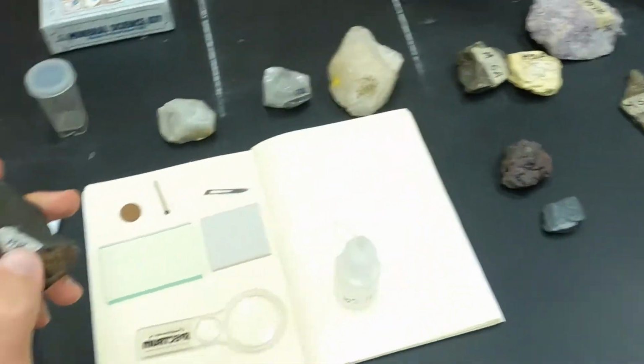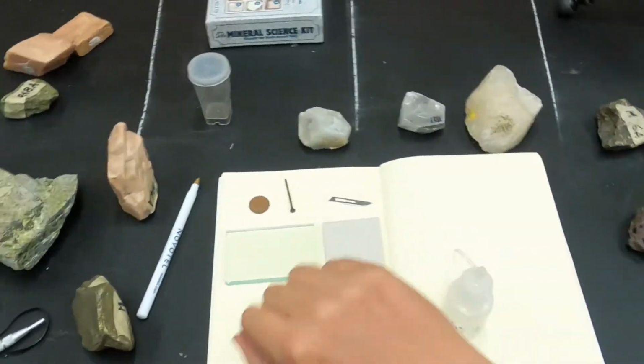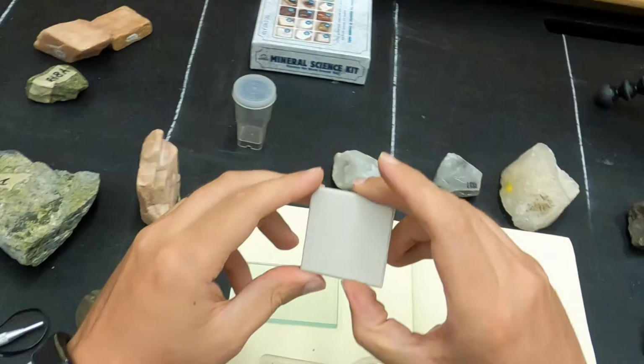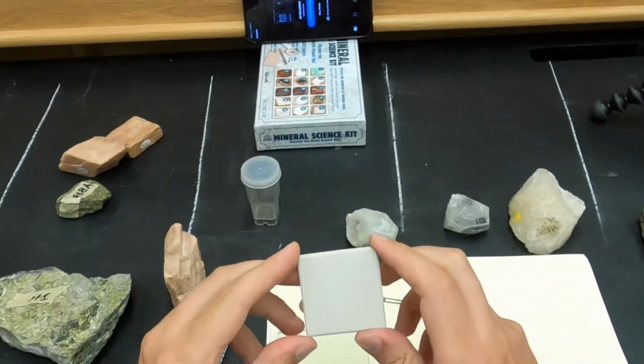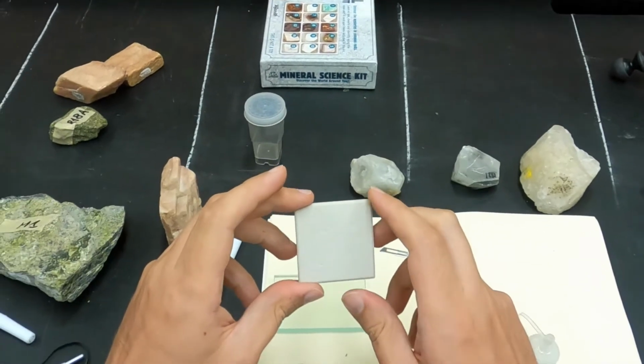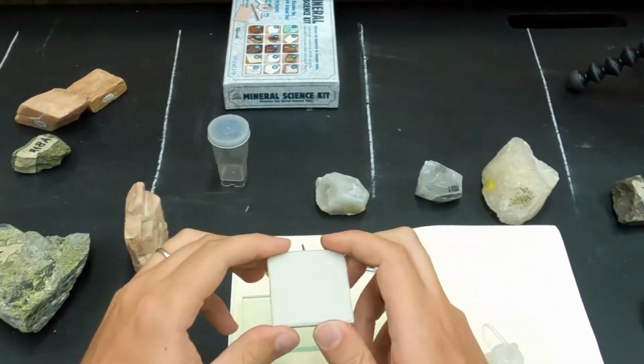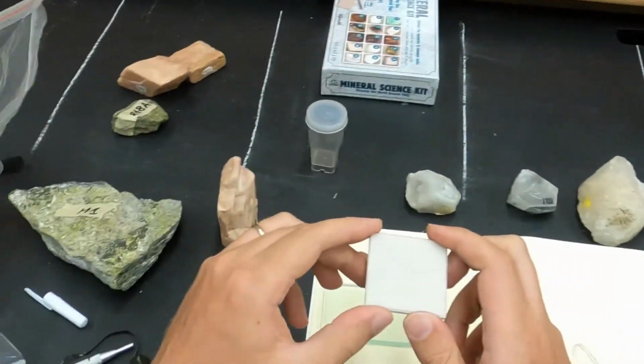One thing I was really forgetting, I think, is the fact that the streak plate is not only used for the identification of hardness, we also use it for testing for streak color.